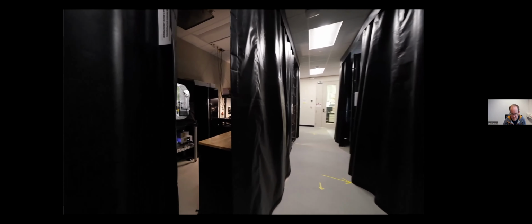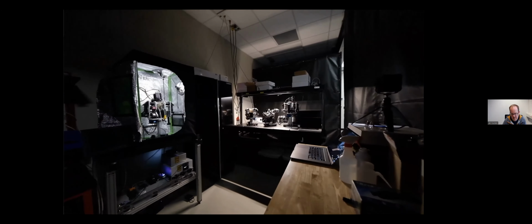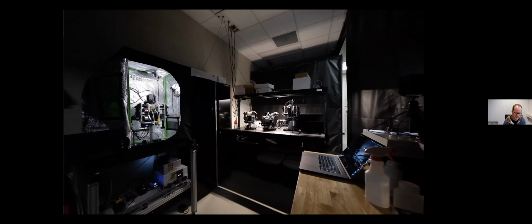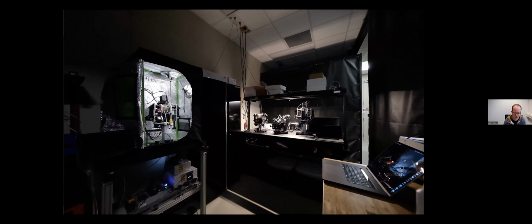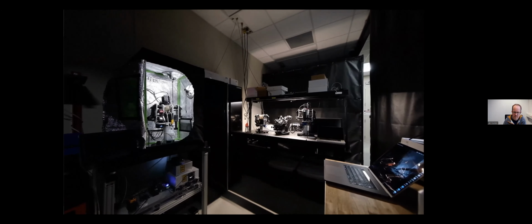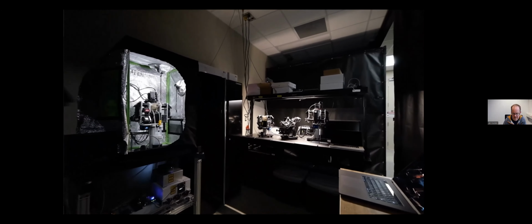And as you can see here in my lab in Madison, we had a number of these Flamingos sitting on the table side by side. The reason here was primarily to have a selection of different systems available to whatever the collaborators would need or we would need in the lab. We could simply pick and choose whichever configuration is best for a given task.